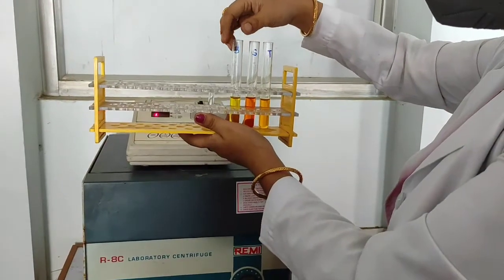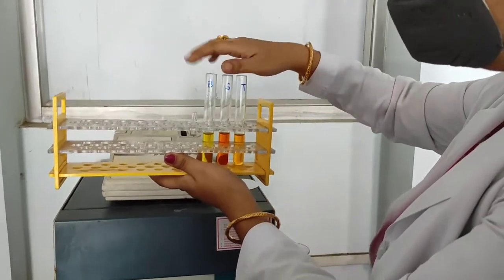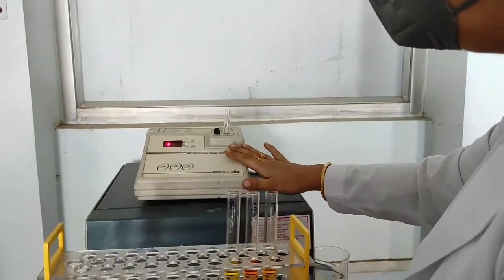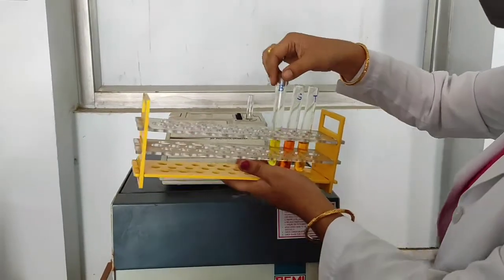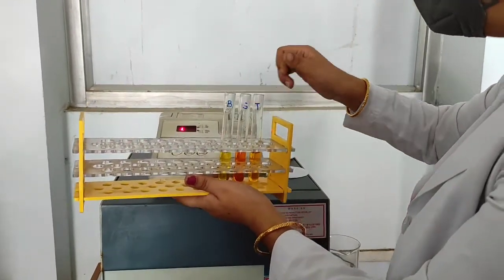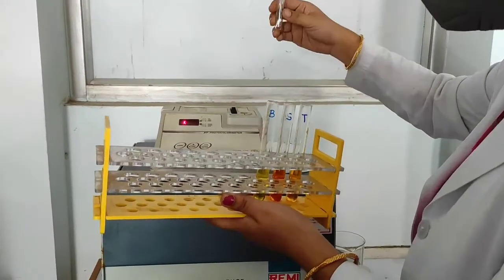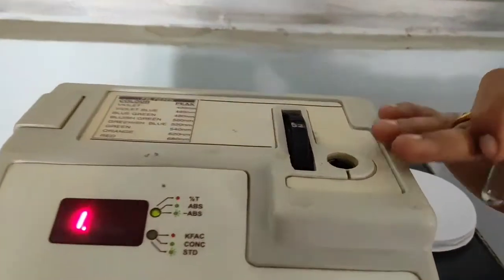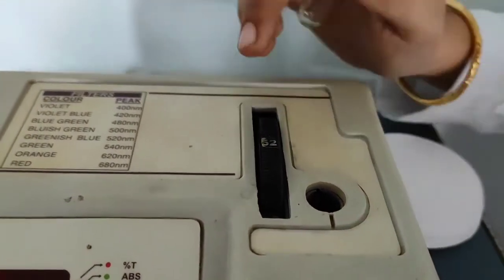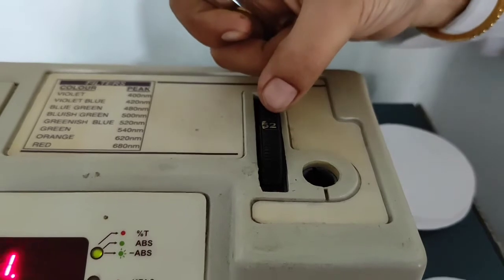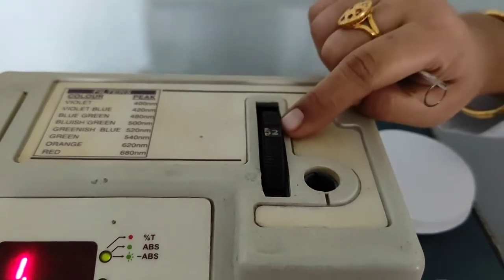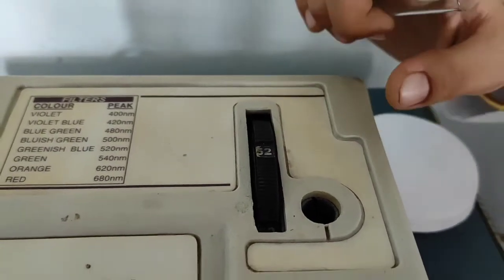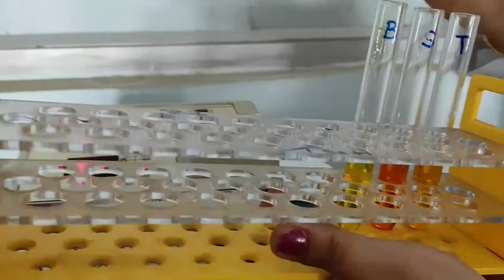These are the 3 test tubes. After keeping the test tubes for 10 minutes, I'll be measuring the optical density with this colorimeter. This is the blank, this is the standard, this is the test. I'll be using cuvettes. And this is the colorimeter. And the wavelength should be 520. This is 520. So, I'll be measuring the optical density of these 3 test tubes.